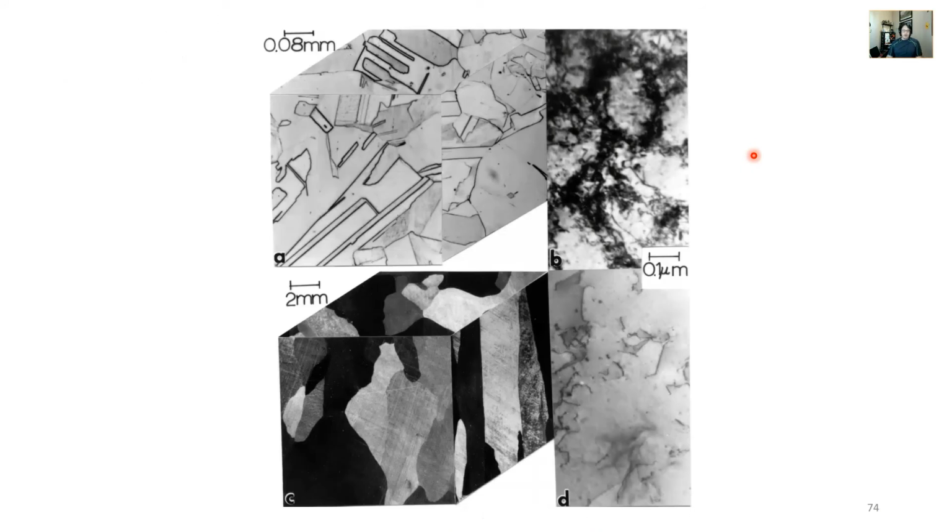Again, just kind of showing an example of using optical microscopy in conjunction with TEM. So these are, again, from the materials I did for hypervelocity impact. So we have this oxygen-free high conductivity copper. It's kind of equiaxed grained. It has dislocation cells, so dislocation density is pretty high. So we have two things working in favor of hardness and yield strength. So kind of a small grain size relative to this copper, both copper.